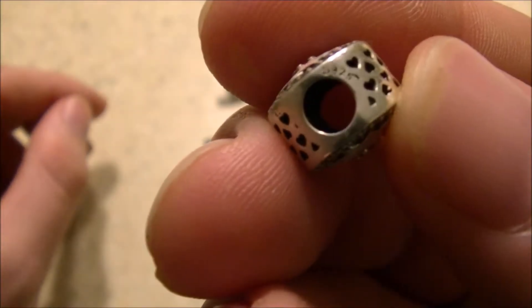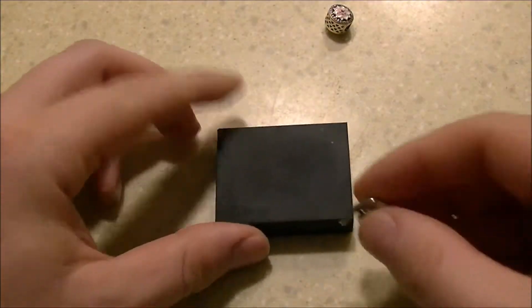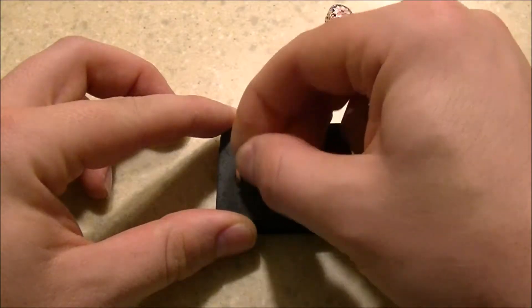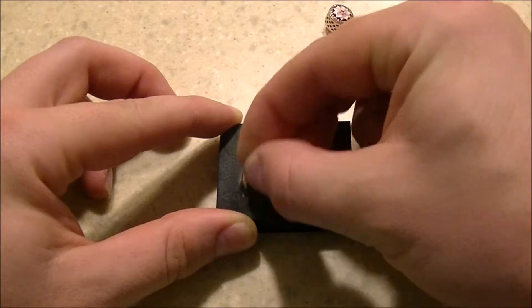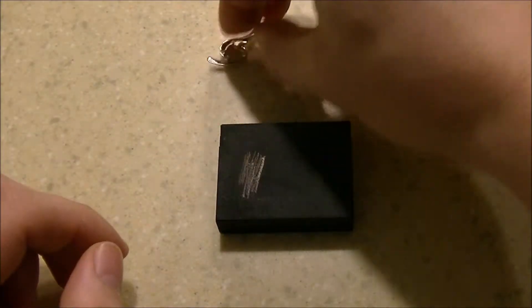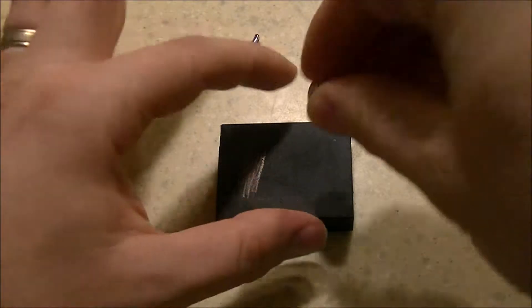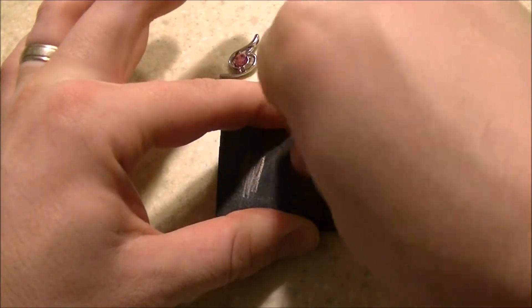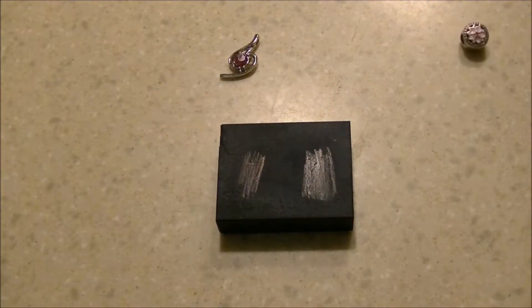Quick run through — it's going to be two separate tests of the same material. The one on the right that you're looking at right now is 925 sterling. It's a charm that I know the background of and I bought it myself at a store, so it's reputable. I know it happens to be silver. The one that's being scratched right now is a piece of zinc alloy jewelry. Zinc alloy is being put out there a great deal as sterling by fakers, essentially, because it is very shiny and it is very white in color. So this is a great little test to get this done.